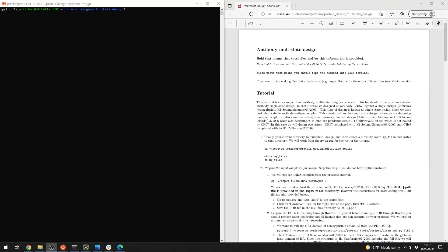That's about it for the single state portion of the tutorial. There's also some additional reading you can look into for deeper learning, in portion 7. We're now moving into the multi-state design portion of the protein design tutorial. This uses some files generated during the single state portion and has a fair amount of overlap. The primary difference is that instead of designing a single antibody against a single antigen, we're now designing an antibody against multiple antigens — useful for designing broadly neutralizing antibodies or designing against multiple variants from antigenic drift.